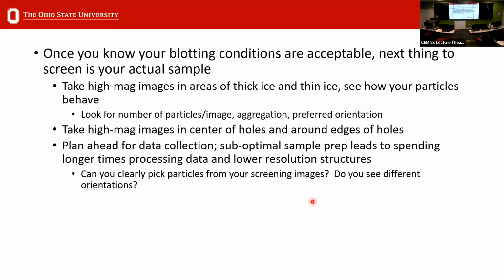Plan ahead for data collection. So you have a grid, and you think, well, the ice is a little bit on the thicker side, but I think I can still squeeze out some data from this. And that's fine. But you have to ask yourself, is it worth spending the time to have 24 hours of Krios data collection and the extra processing you'll have to go through to try to squeeze out a structure? Or is it more worth your time to maybe reserve an extra round of screening on the Glacios? So it's going to depend on your project, and it's going to depend on your project goals.